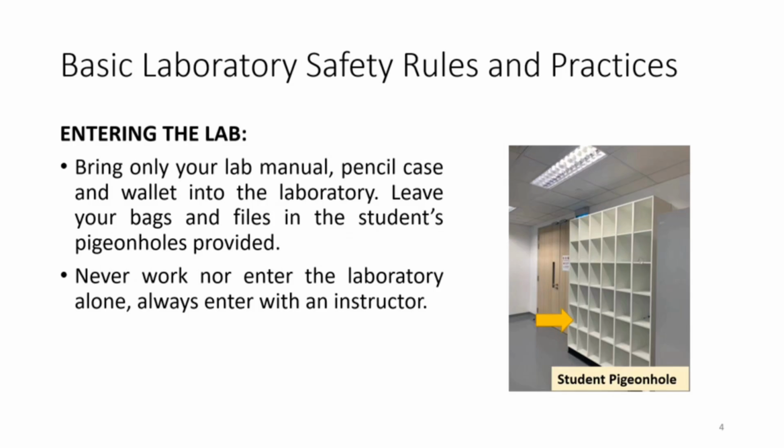Upon entering the lab, bring only your lab manual, pencil case and wallet into the lab. Put your bags and files in the students' pigeonholes provided, as shown in the picture here. This is to avoid overcrowding of the working bench and damage in case of spillage or fire. Always work or enter the lab only when the instructor is inside the laboratory.